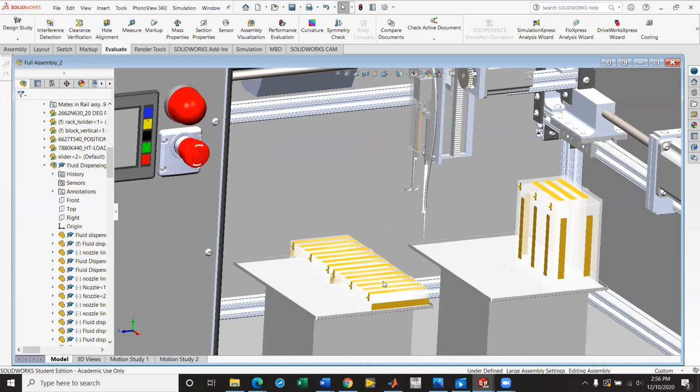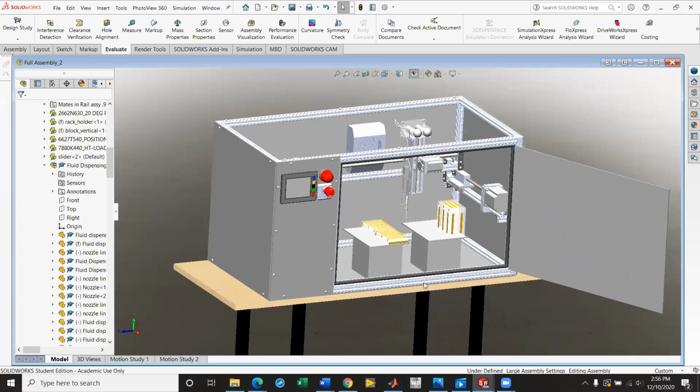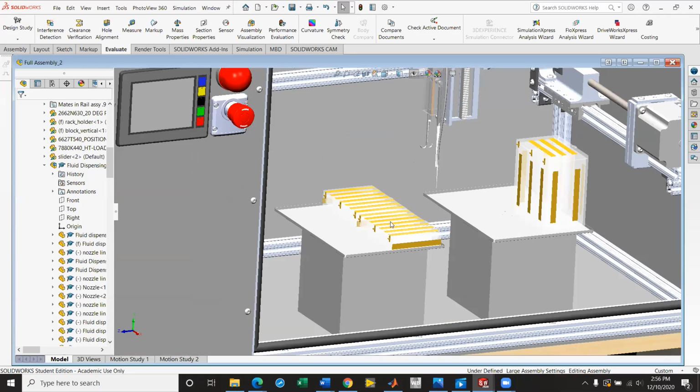And also for gaseous environment, the tubes will actually be connected individually to the containers of the culture plates and the tube containers too. So no gases will be inside the interior other than in those compartments. Okay. So you wouldn't have to control the humidity in the entire chamber, just in that. That should be easy. Evaporation of small volumes of liquid is a concern. Right. All these are sealed and stay sealed unless fluid is being added or subtracted.